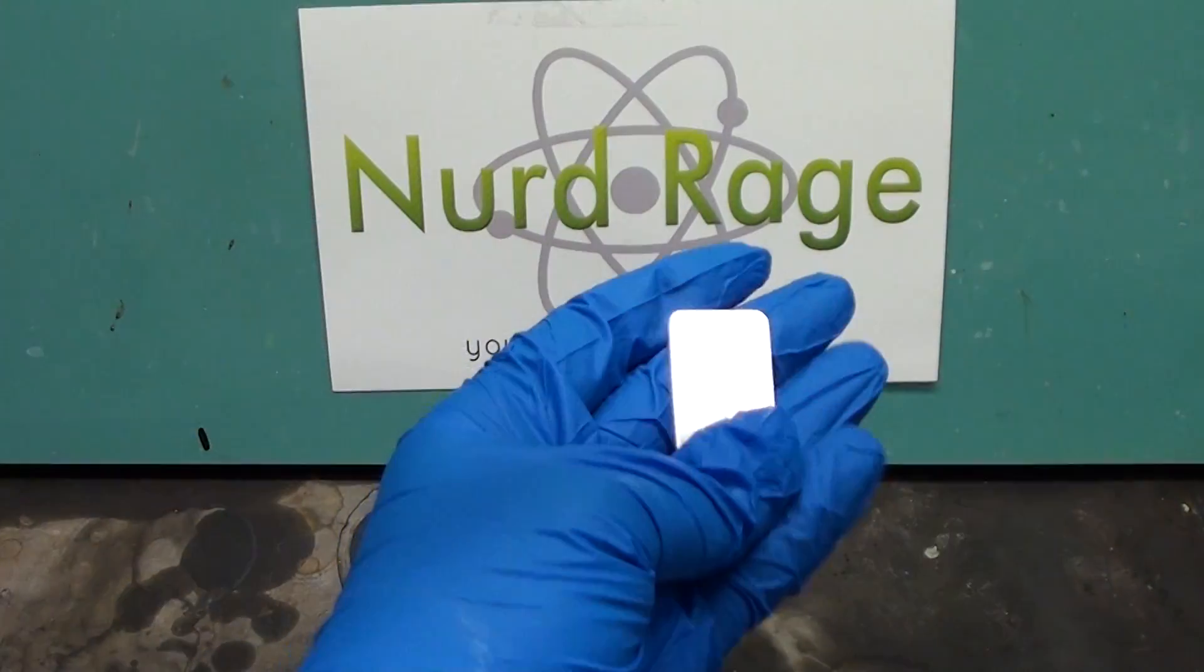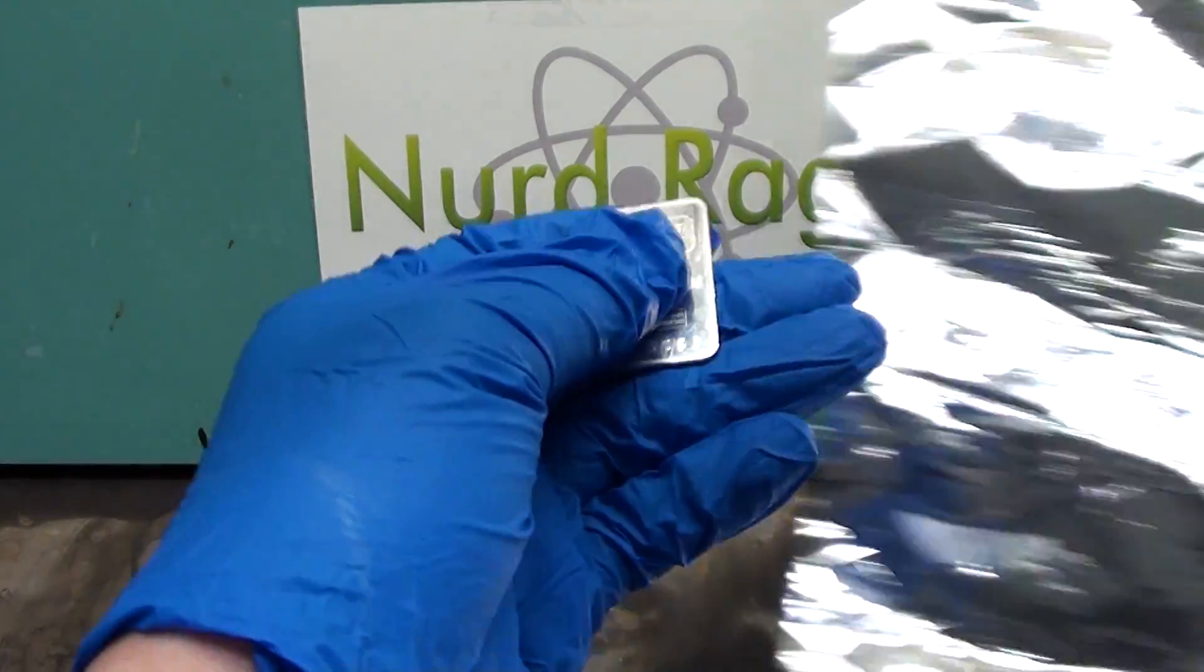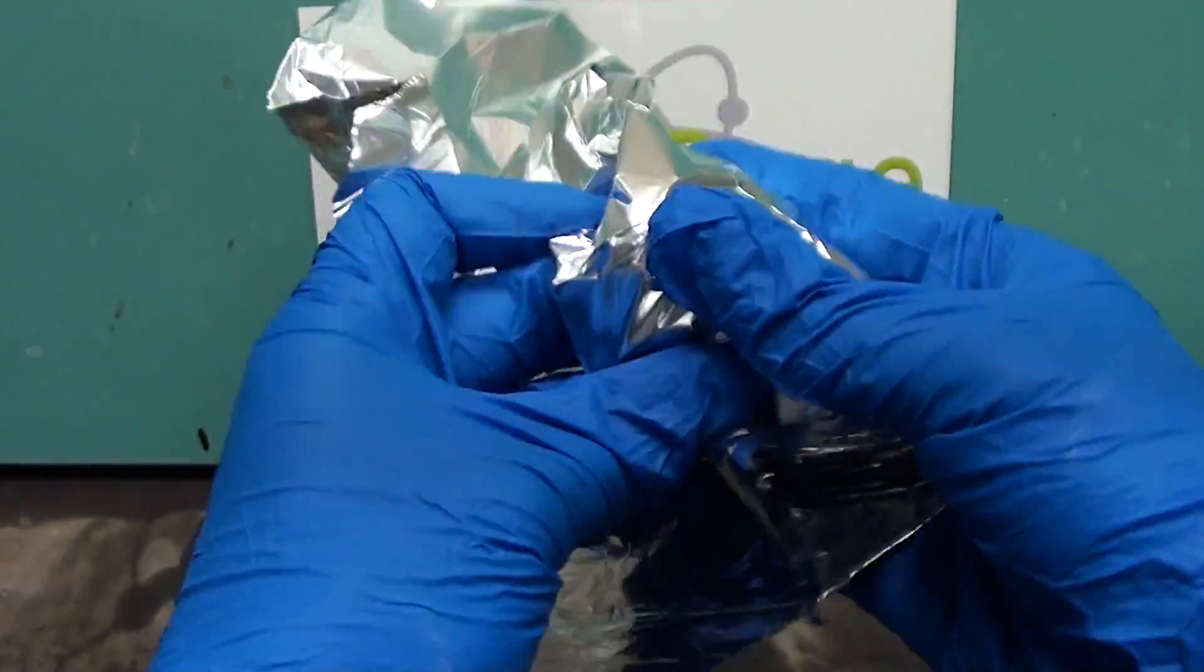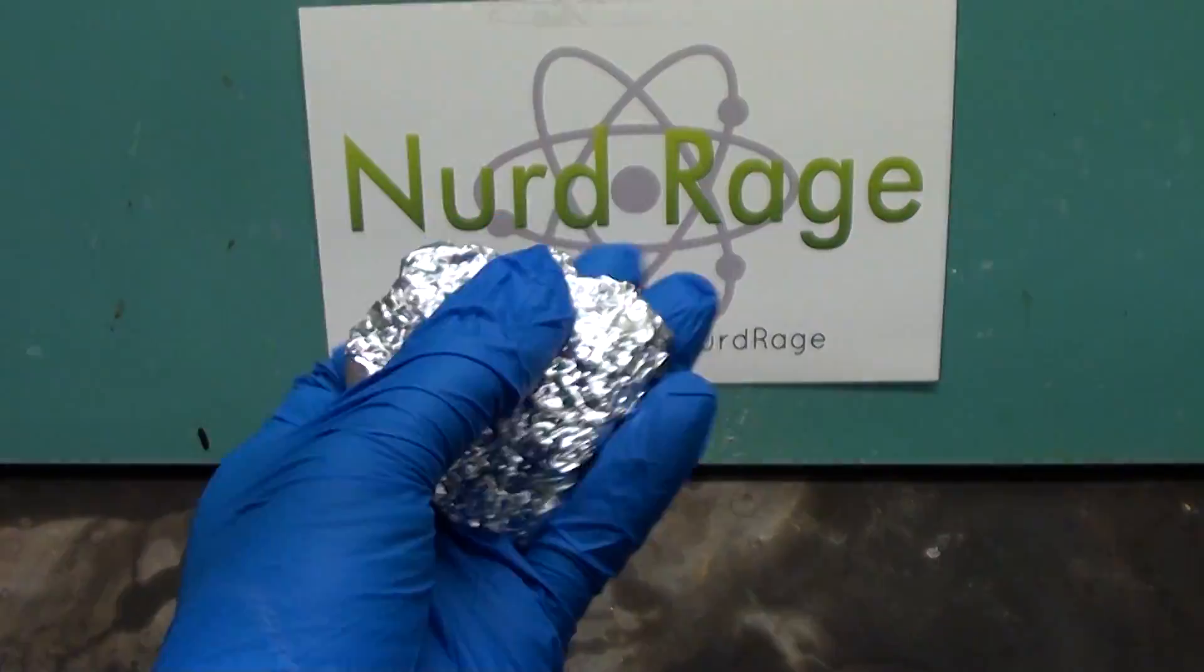Here I have a one troy ounce bar of platinum metal. The first test will be in hydrochloric acid, so I'm wrapping it in aluminum foil for comparison purposes.